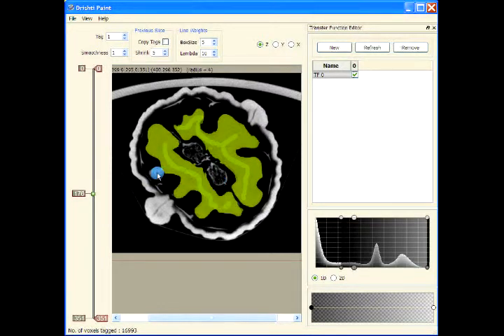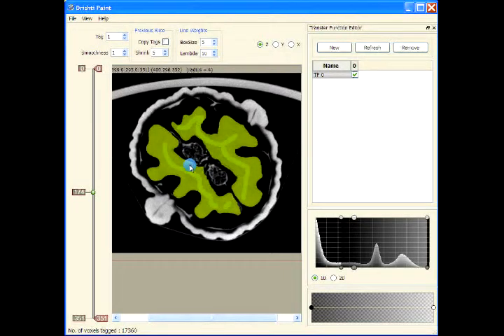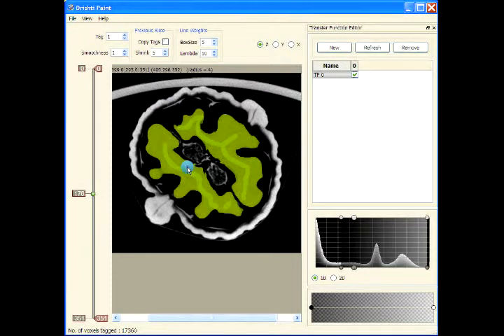We missed it here, so put a dot here and then press tag, and then you can remove the dot, and so on. So this is one way where you can go slice by slice and then press T to tag the slices. So let me press escape to remove these markings. Press escape and then press reset.